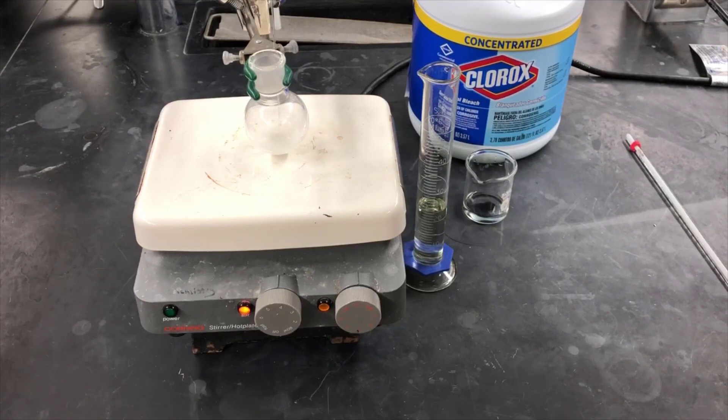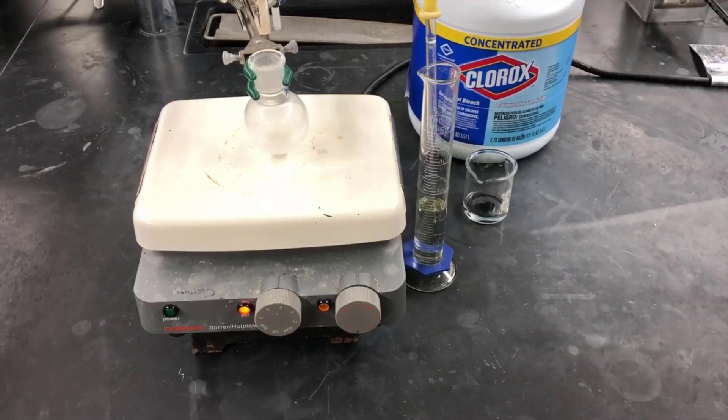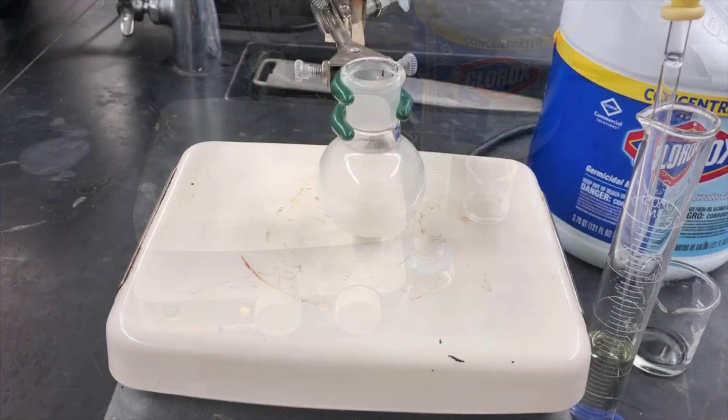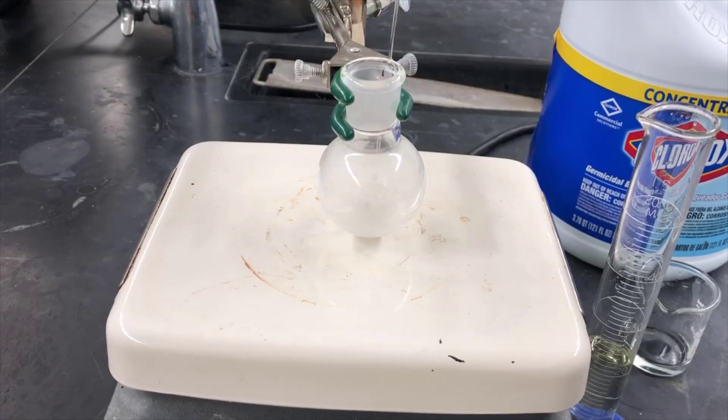You'll notice I'm checking the temperature of the solution every so often here. We want to keep the temperature of the reaction below about 50 degrees. The reaction is fairly exothermic, especially in the early stages when you're adding the first few milliliters of bleach.